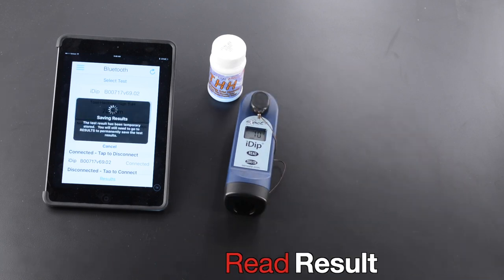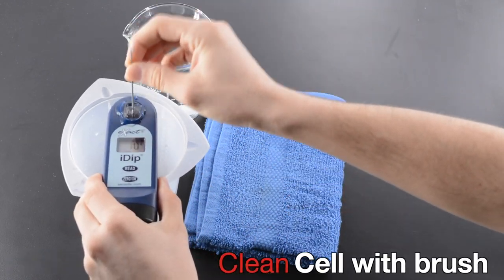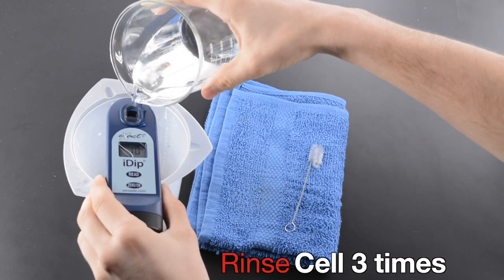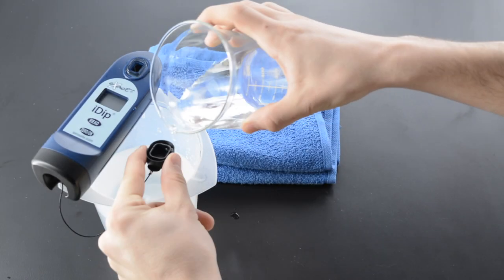Read result. Empty cell. Clean cell with brush. Rinse cell three times. Rinse cap three times.